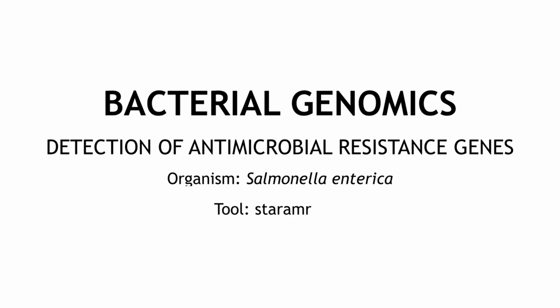In today's video, I'm going to show you how you can identify antimicrobial resistance genes using the tool STARAMR. So what we are going to do is use STARAMR to scan whole genome sequences of 2 Salmonella enterica serovar isolates. That's what we are going to do.